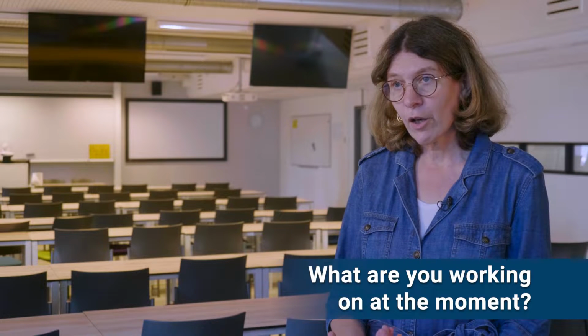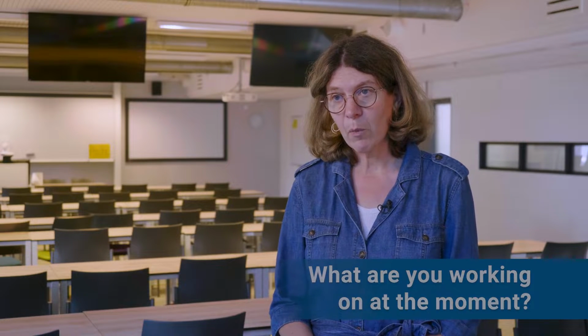I am Anne Lesage. I am working for the CNRS, the National Center of Research in France, and at the High-Field NMR Center in Lyon. What I am working on is developing dynamic nuclear polarizations to improve the sensitivity of this spectroscopy and tackle challenging substrates such as surfaces or complex biomolecular assemblies.